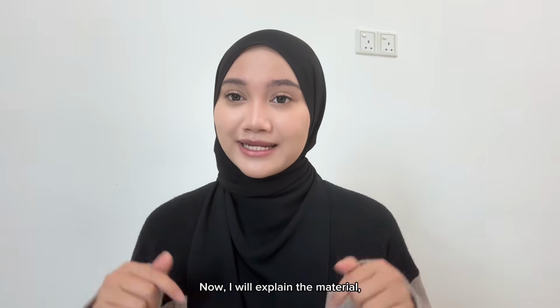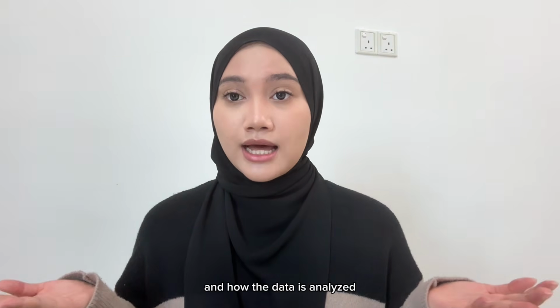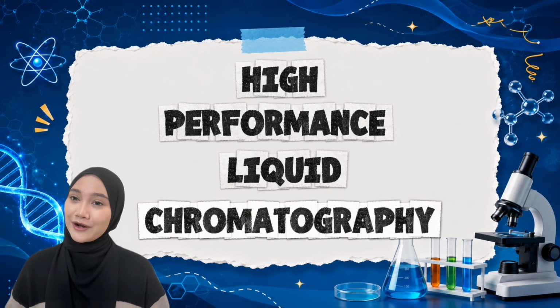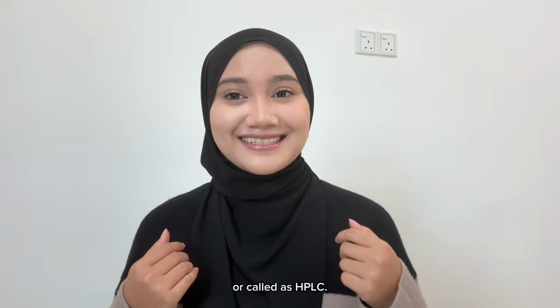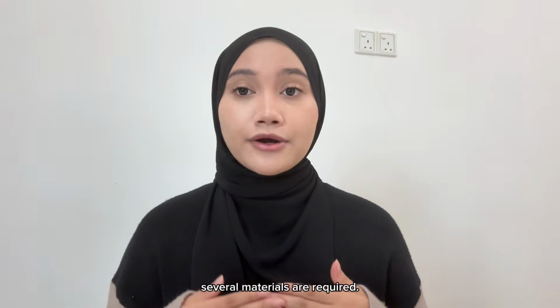Hi, I'm Amna. Now I will explain the materials, methodology, and how the data is analyzed using high-performance liquid chromatography, or HPLC. To perform the sugar analysis, several materials are required.